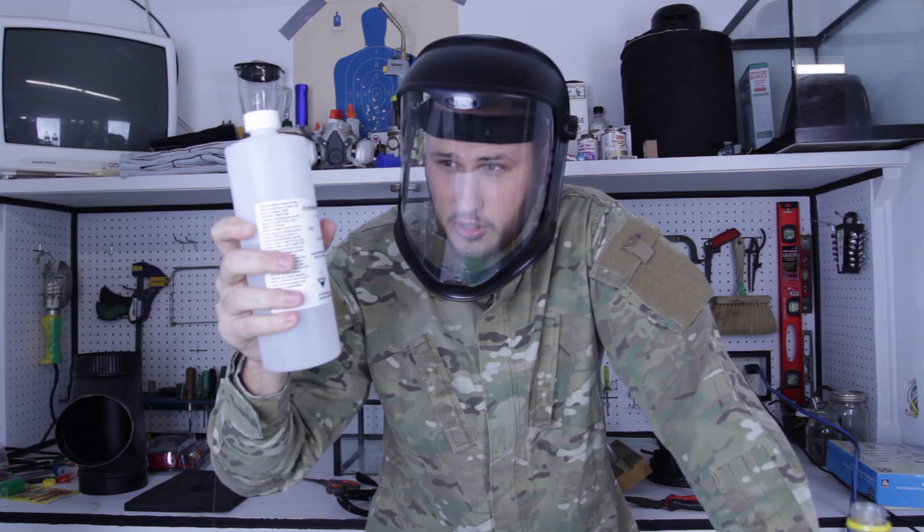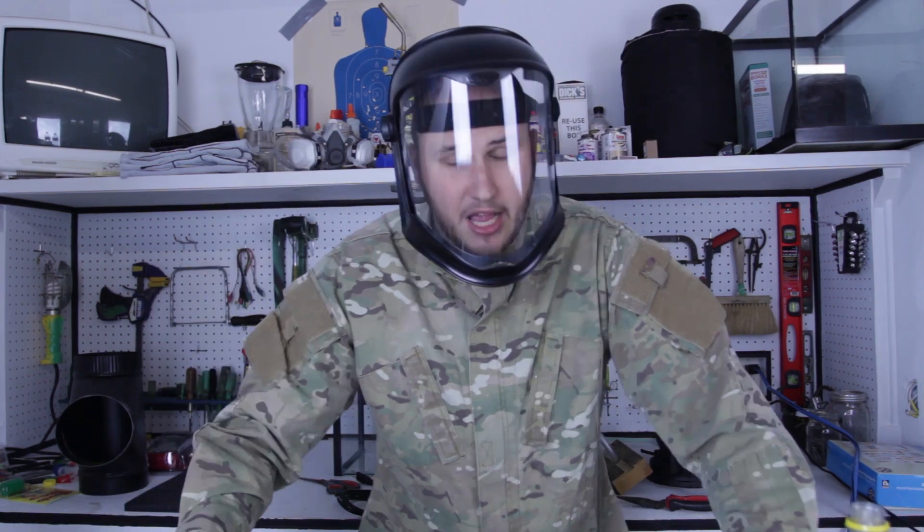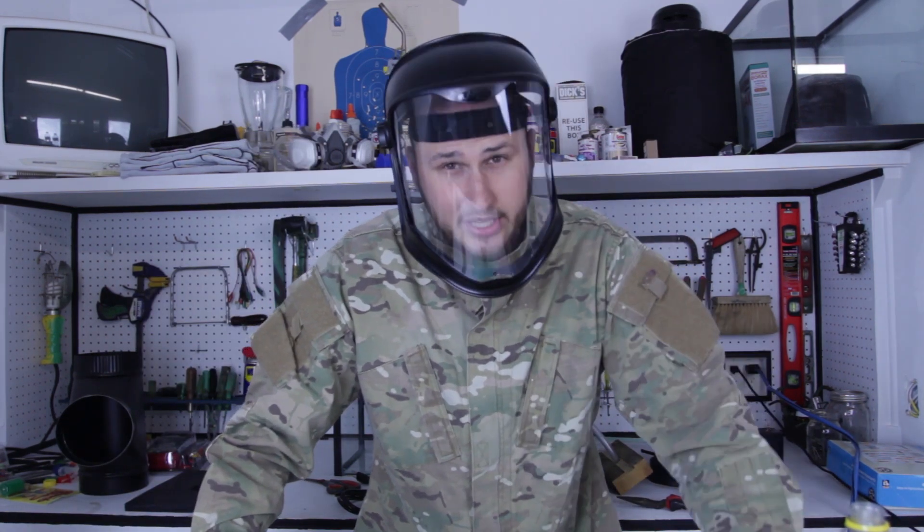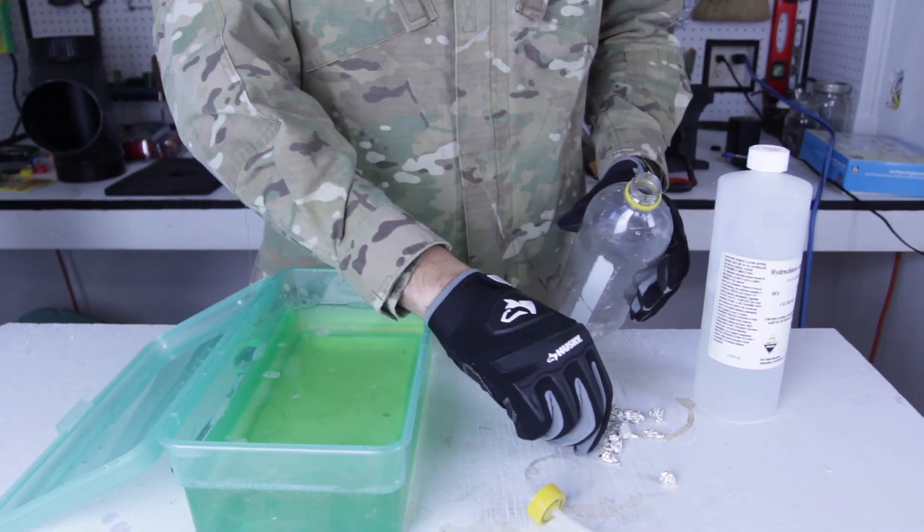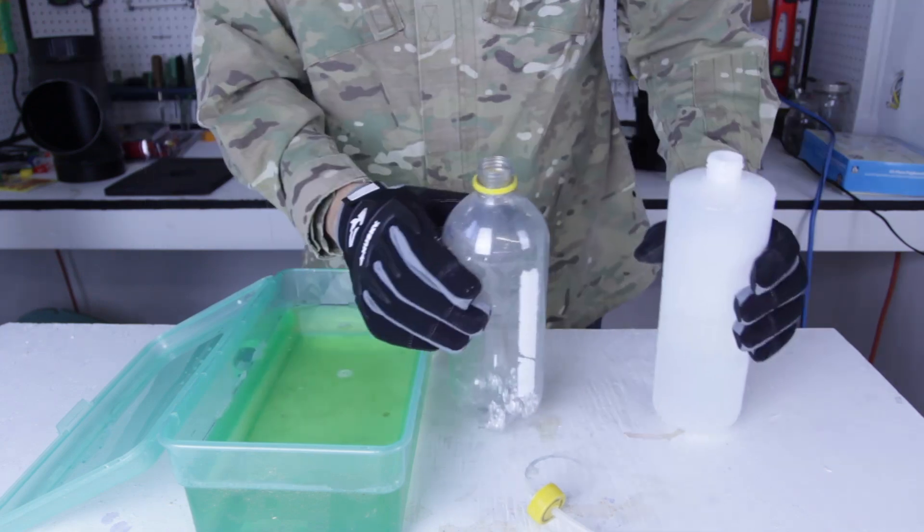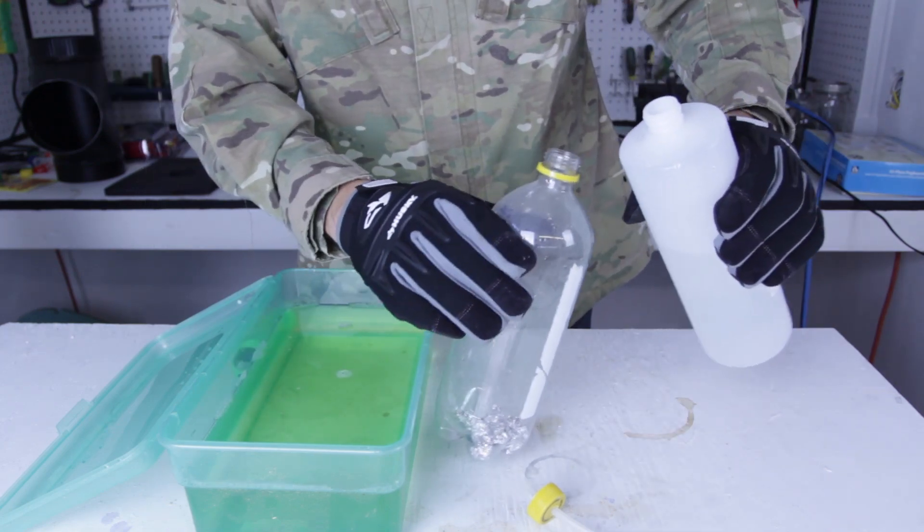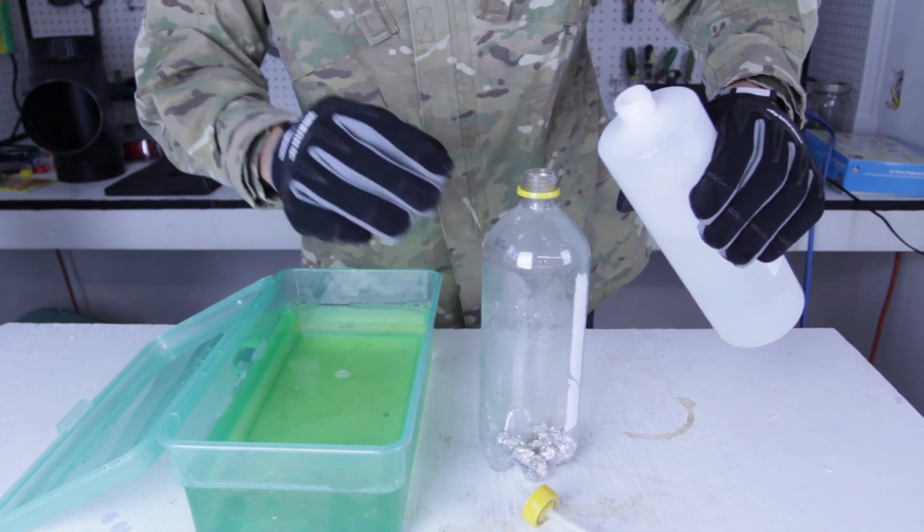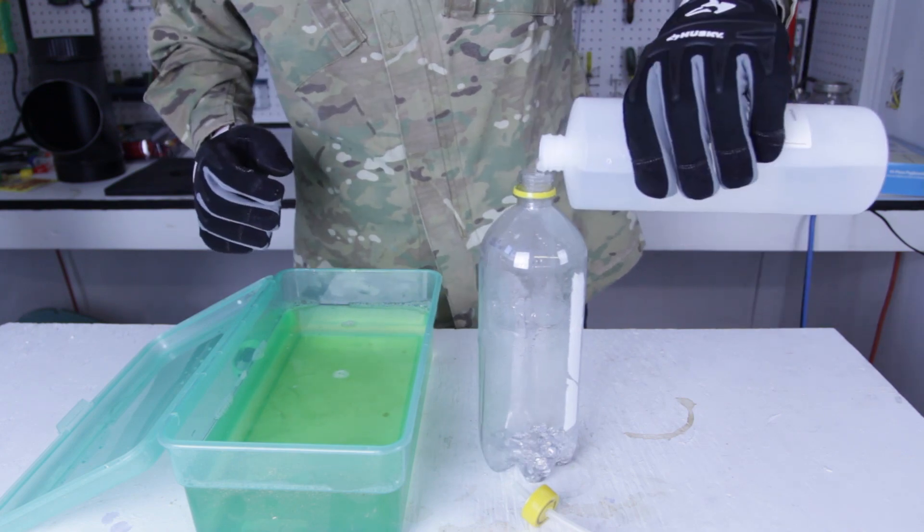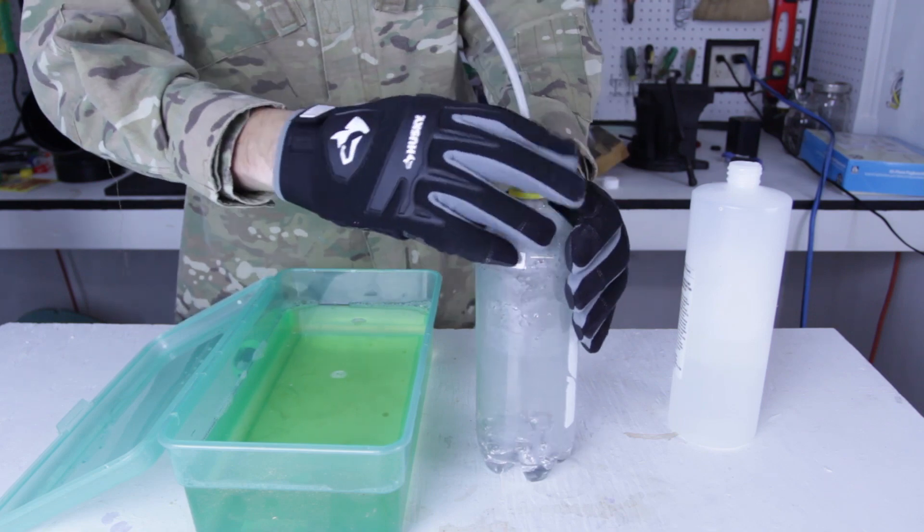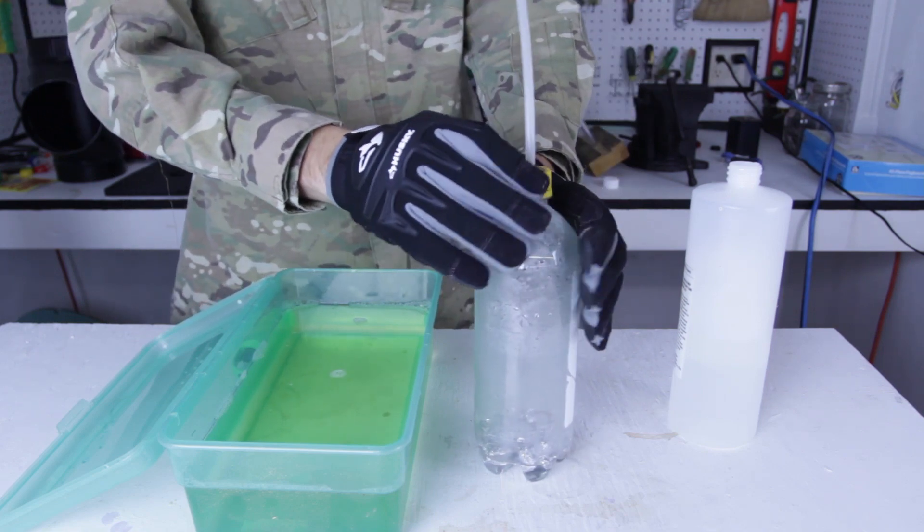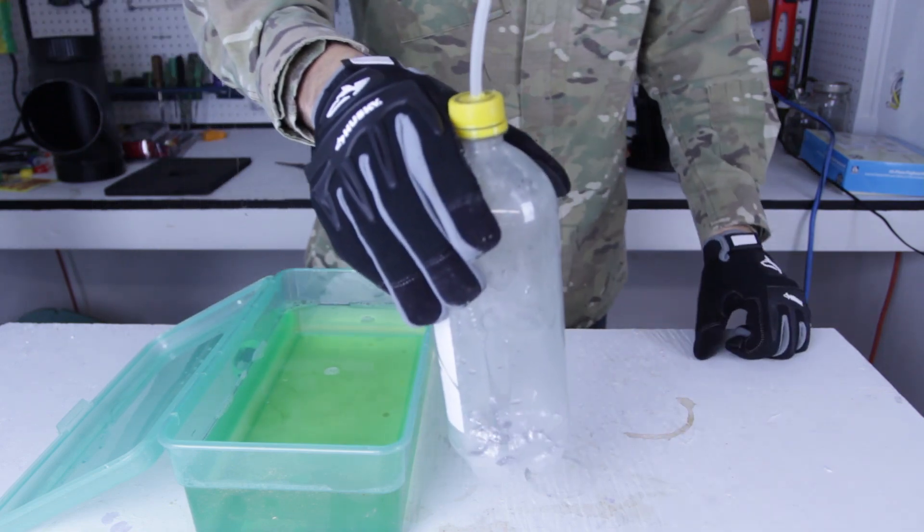I'm going to be using hydrochloric acid, 37%, and aluminum foil. Let's check this out. So what I'm going to do is put a bunch of aluminum foil into the bottle, put a little bit of hydrochloric acid in this bottle, close the lid, then wait till the reaction starts.